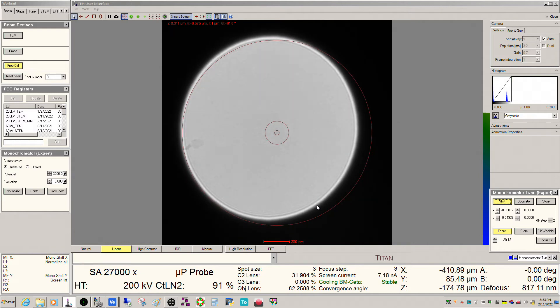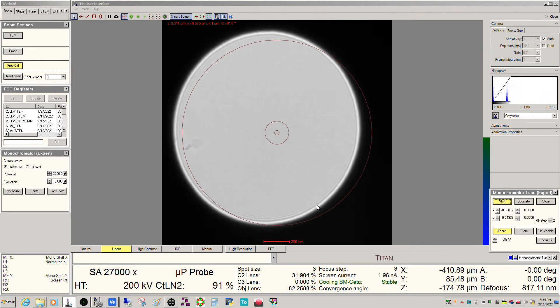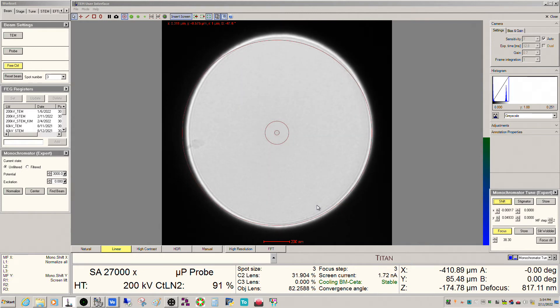Normally I put this at around 40. With the 70 micron C2 aperture, that gives me a STEM current usually around 20–25 picoamps, which is sufficient for that. I'm using the trackball now, not the monochromator shift.